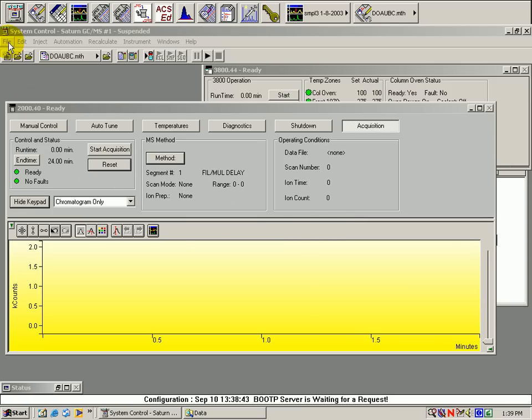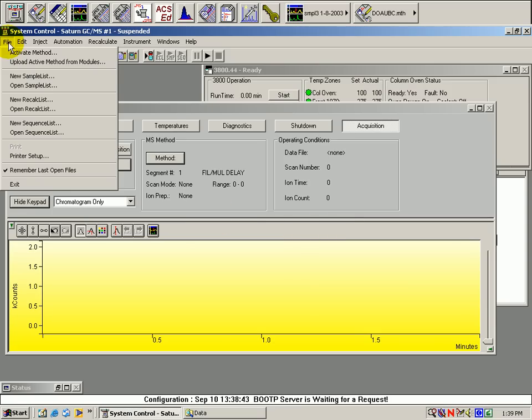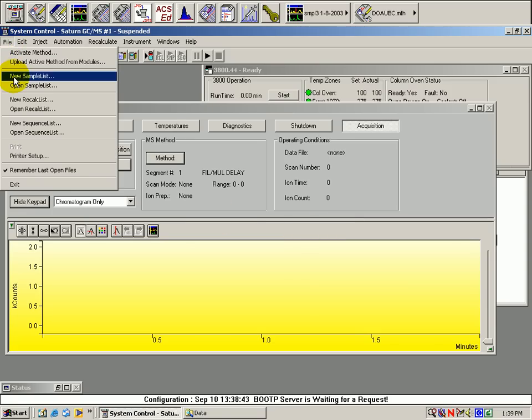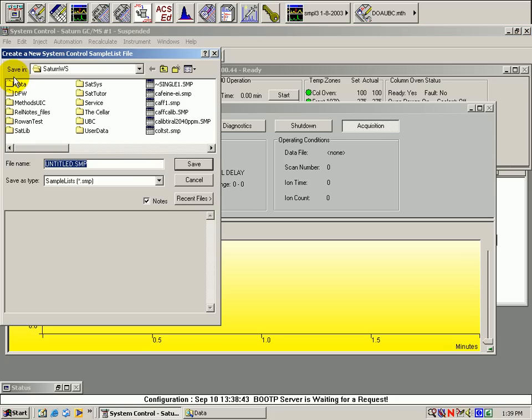To make multiple automated sample injections, go to the drop down menu under File and open New Sample List.